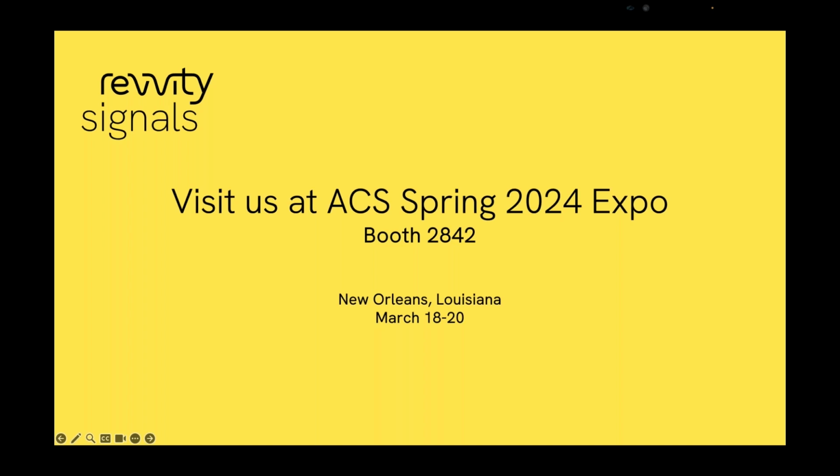There's another question: will sunsetting of Chem Office impact the development of ChemDraw applications for Windows? Nope. As I mentioned as well, the ChemDraw applications, so Chem 3D, ChemDraw for Excel, ChemFinder, ChemScript, all of those applications are part of the Signals ChemDraw offering. So those are still being supported and developed as part of the Signals ChemDraw offering.